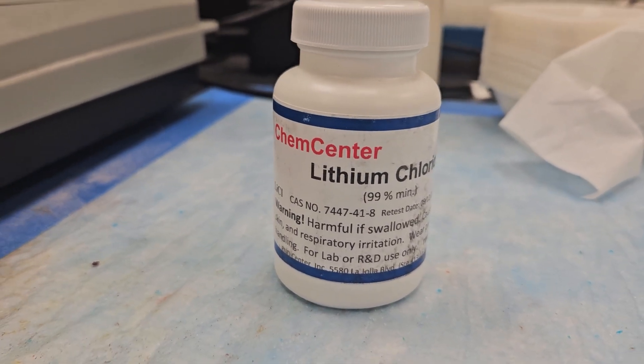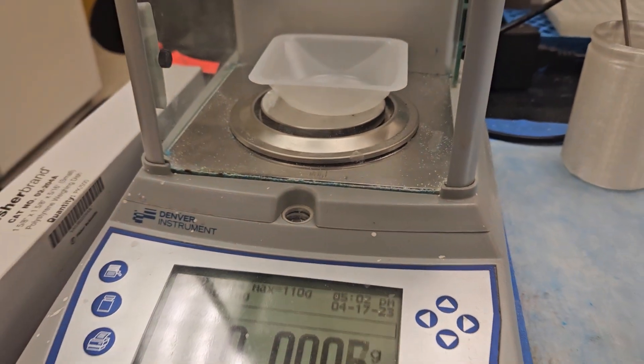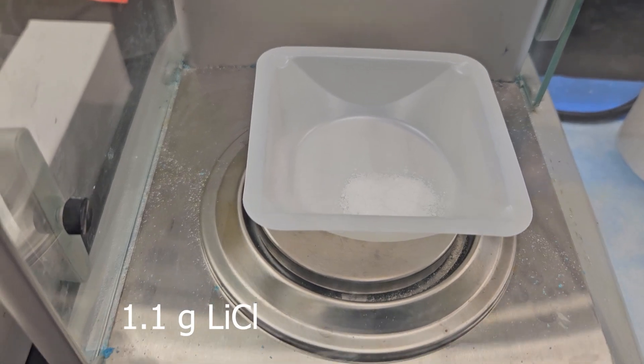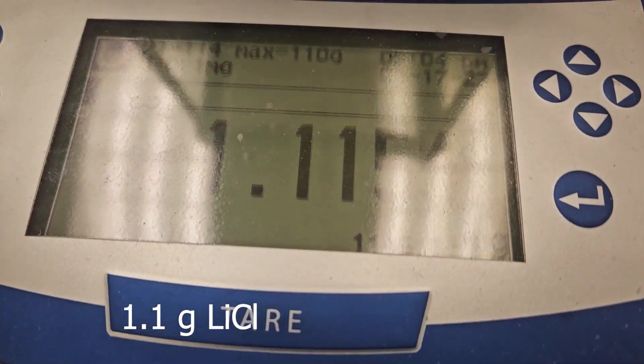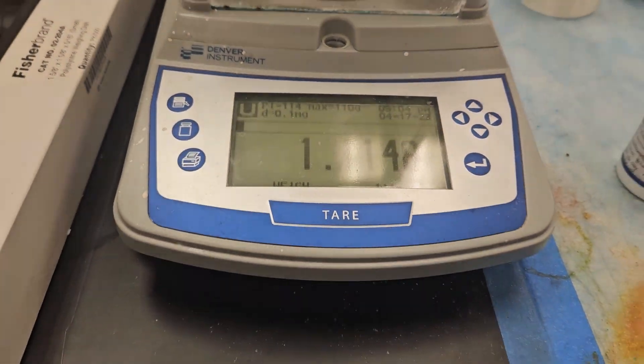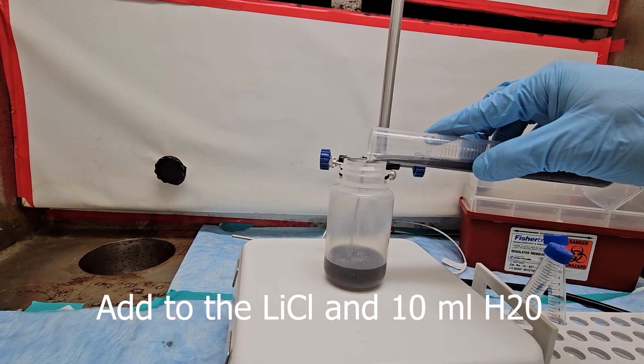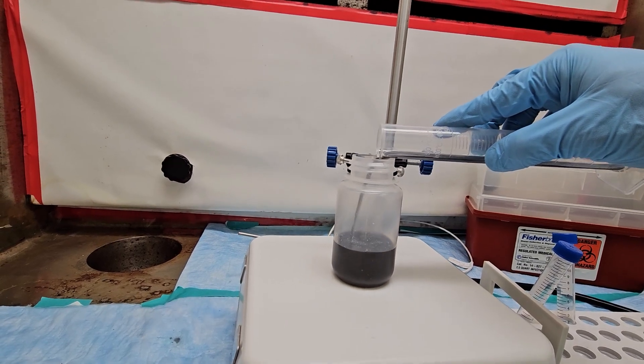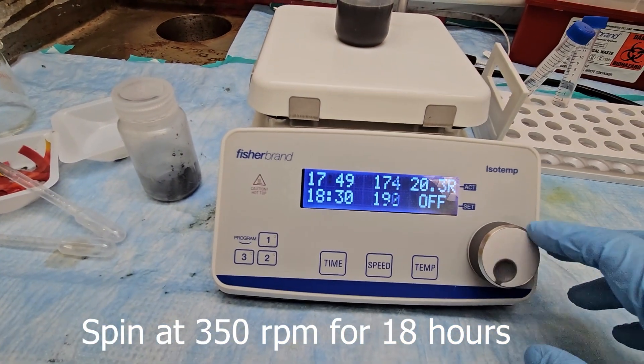As mentioned before, our delaminating reagent will be lithium chloride, and for that we've been measuring out approximately 1.1 grams. This will be combined with 10 milliliters of water in a plastic bottle on a stirring plate, with the 40 milliliter solution of multi-layer MXene flake diluted with water. This will be spun at 350 rpm for approximately 18 hours.